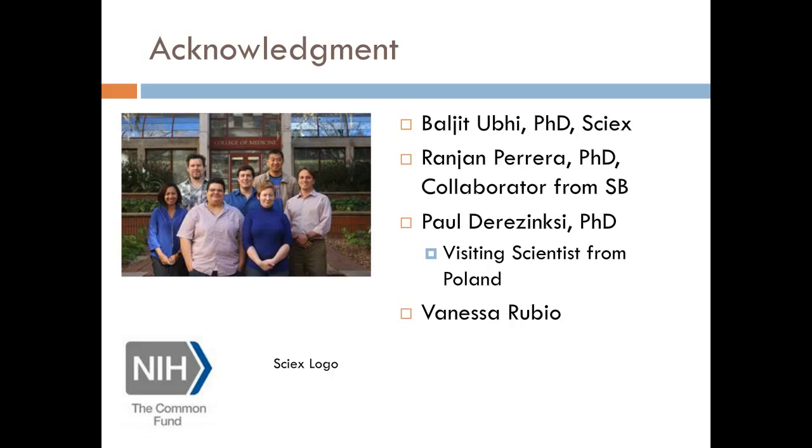Next person says, very interesting data. What are the follow-up steps to this pilot study, and is there a larger validation study planned? Our follow-up steps have been in two different areas. One, we validated this on multiple instrument platforms, and we've also validated it with multiple separation modes, including reverse phase and HILIC. Our next phase is working with clinicians and other biorepositories to gain access to new samples to expand this to hundreds of samples rather than the small subset of 40 that we had across this study. So hopefully in the next year or so we'll complete those final steps and have a validation study to be published and presented to the world.